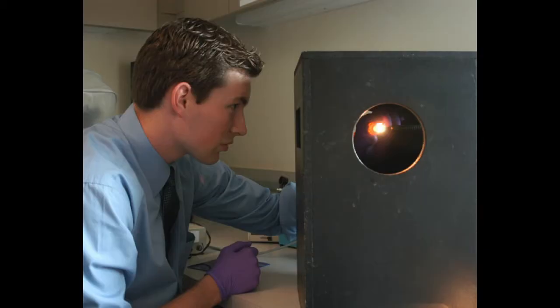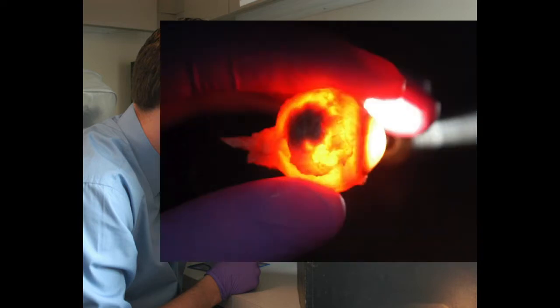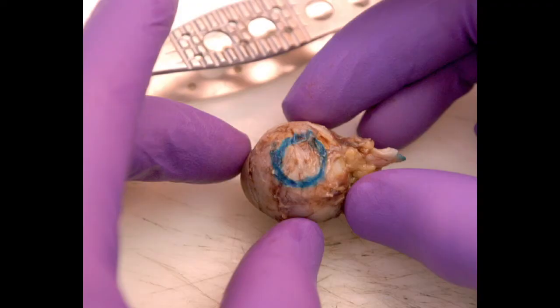In our laboratory, we use a special box to perform transillumination. The eye is placed directly on the surface of a fiber optic illuminator, disclosing another tumor shadow at the equator. The location of the tumor shadow is marked with blue pencil.